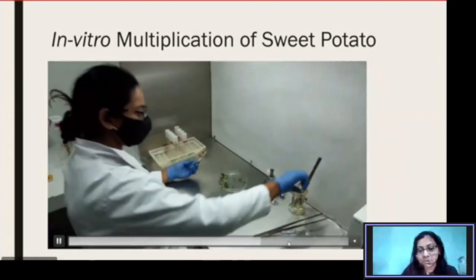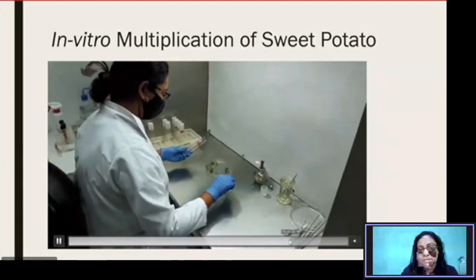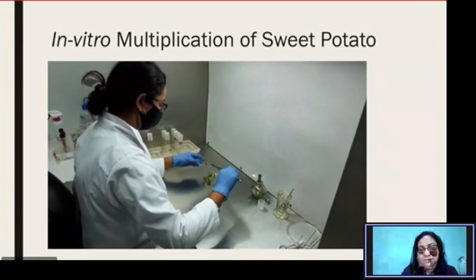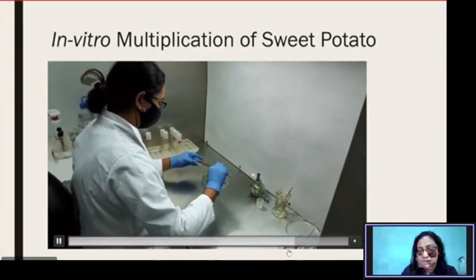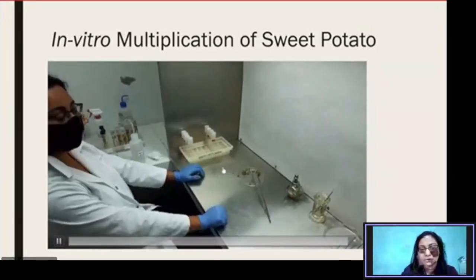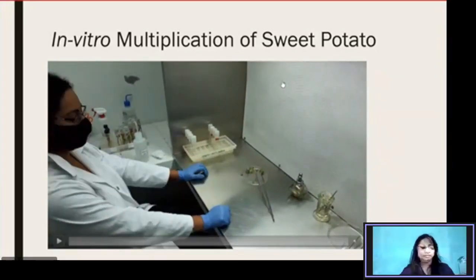And then each is placed into a new tube and cultured again. So from this single explant, I got about four explants.